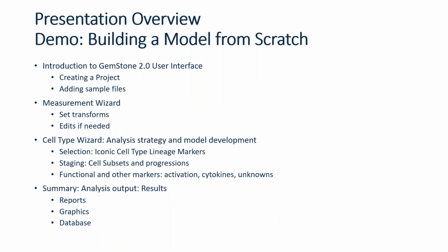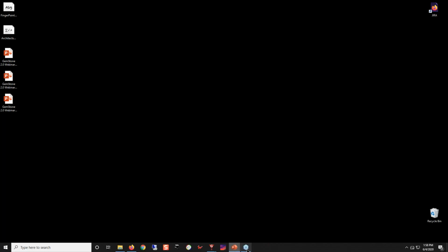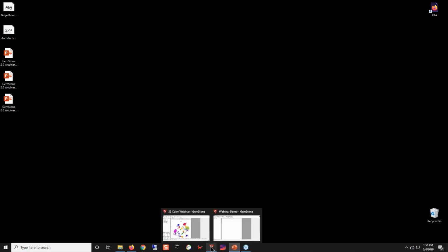So now I'm going to switch to GemStone and give you a demo of the wizards and the modeling process. So instead of telling you, I'm actually going to show you. And we will also take a quick look at the results and the analysis output. I'm going to bring up one of my GemStone programs.